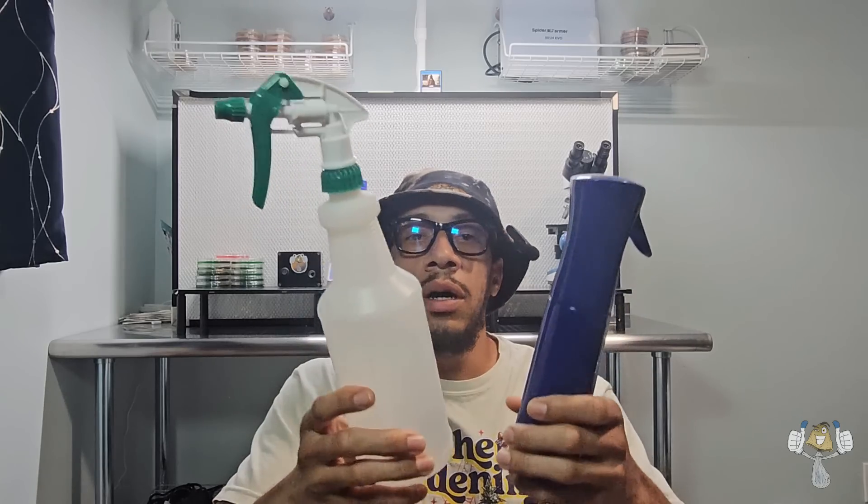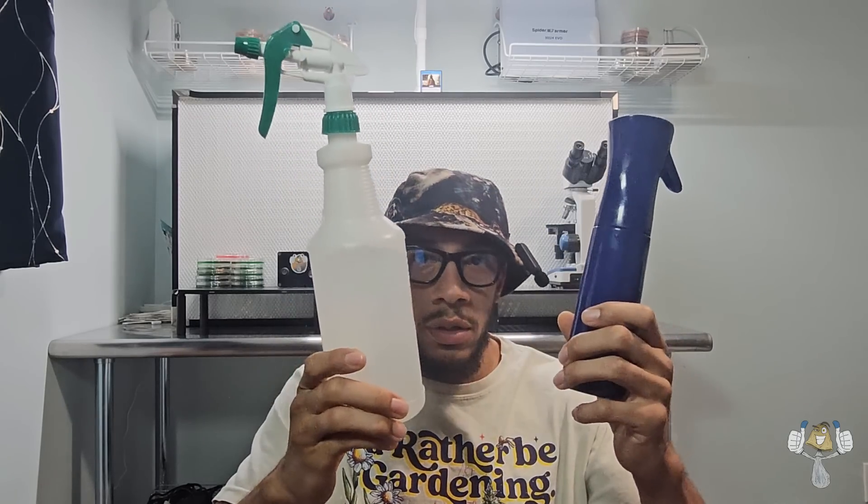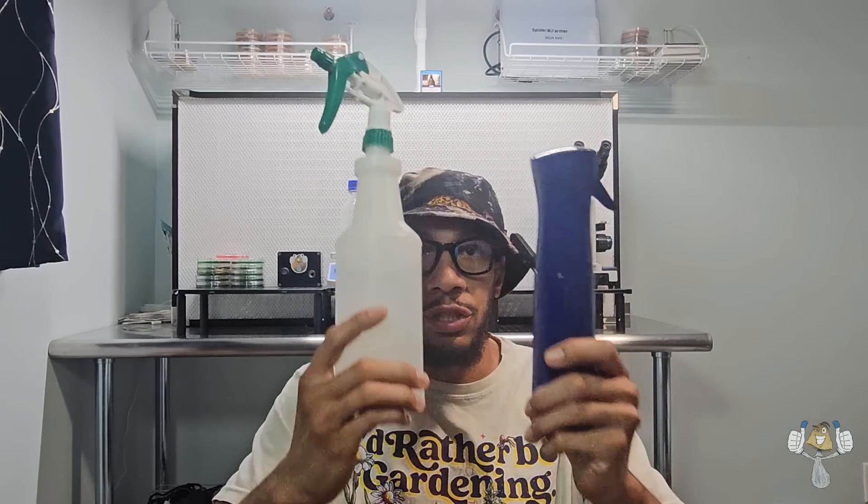Spray bottles. Here we have a spray bottle with just water, and here is a spray bottle of our 70% isopropyl alcohol. Simple spray bottles — one designated for each.